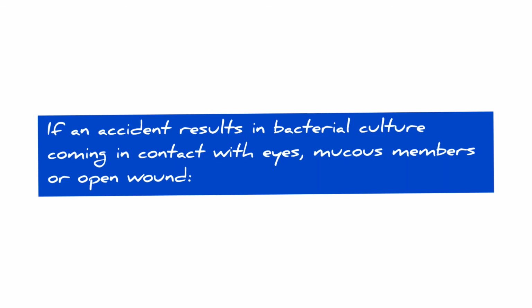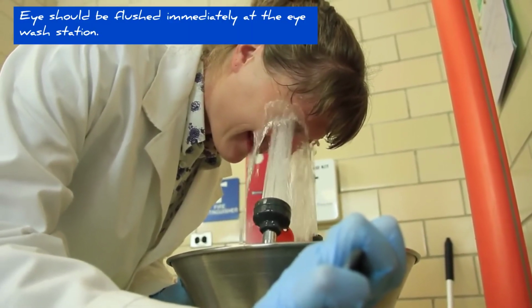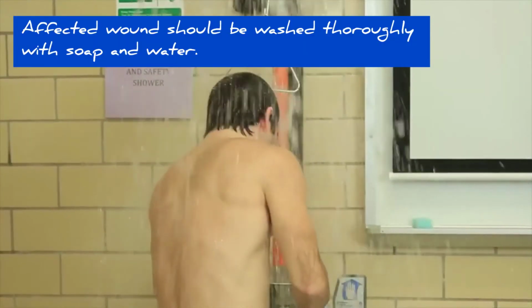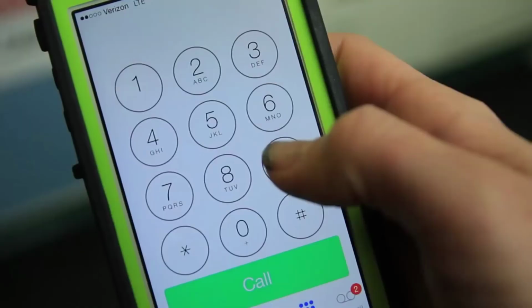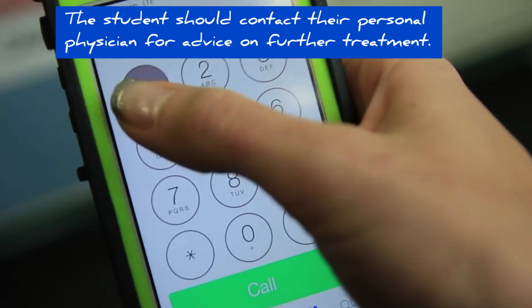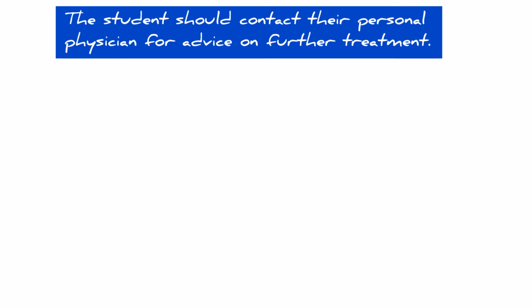Rule number 12. If an accident results in bacterial culture coming in contact with eyes, mucous membrane or an open wound, the eyes should be flushed immediately at the eye wash station. The affected wound should be washed thoroughly with soap and water. The student should contact their personal physician for advice on further treatment.